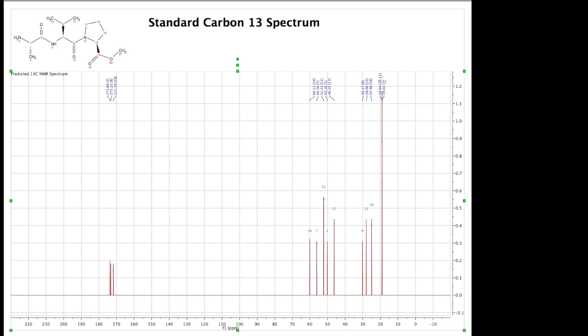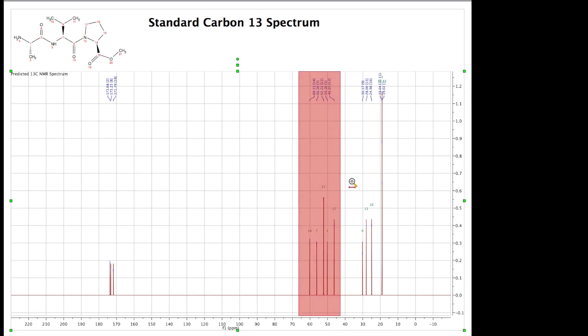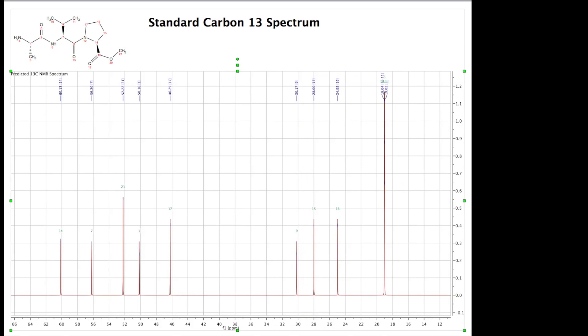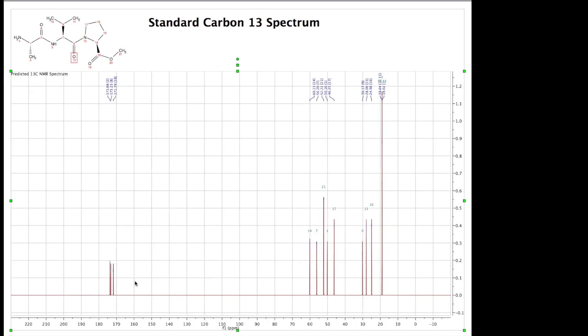What we see before us here is a normal CPD carbon-13 spectrum which you'd see in any synthetic organic chemistry laboratory. They're fantastic, they'll show up all the carbons. But to be honest I tend not to use this technique that often these days. Instead of running a normal carbon spectrum I tend to run what's called a DEPT-Q.